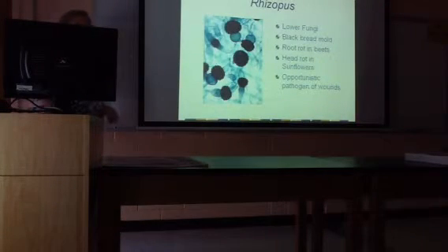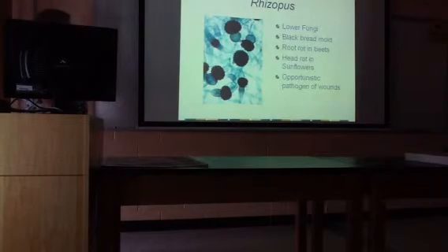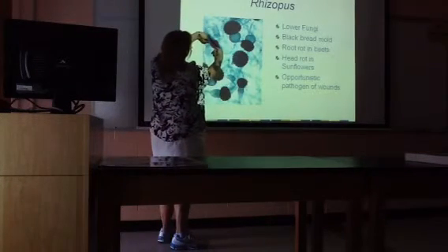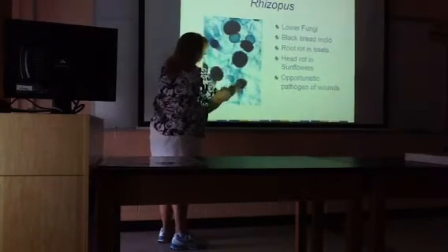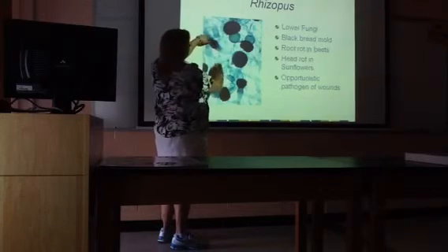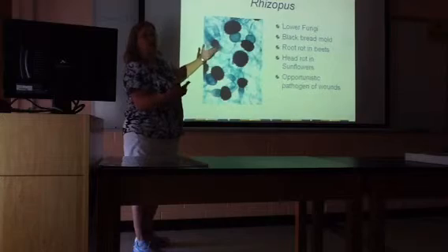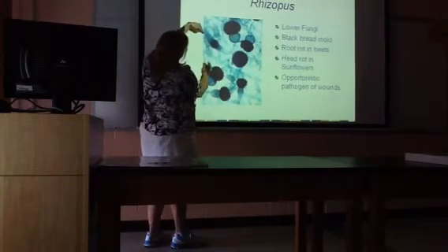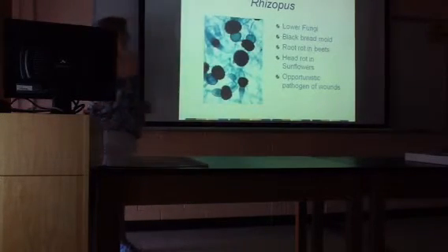Here's the Rhizopus that we talked about. Probably not the best picture of it because it's not showing you that two-tone shape. But I put it in here because what you can see is you've got two hypha that are touched in a ball forming. See here, two hypha that are touched in a ball forming. That's sexual reproduction happening. So you can see that spore forming without a basidium or an ascus. There's another one probably right here in the early stages where the two are touched and they will form a spore like that as well.